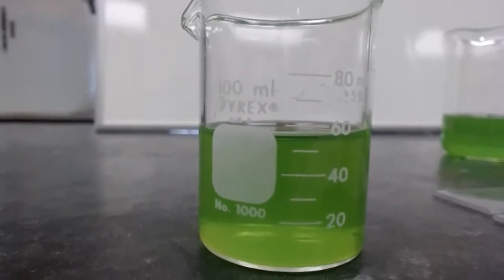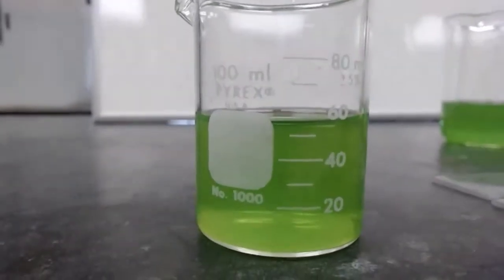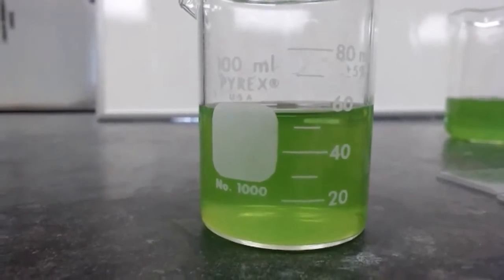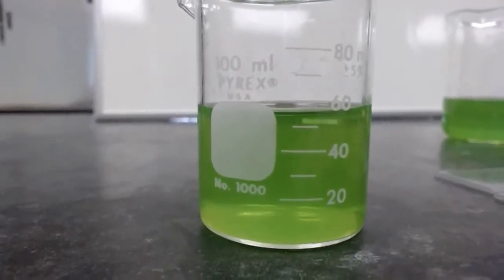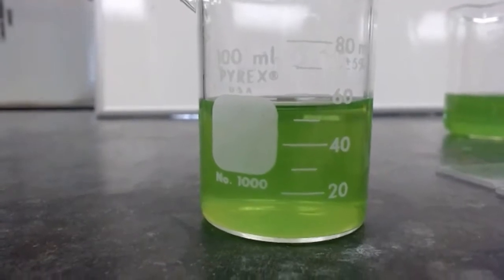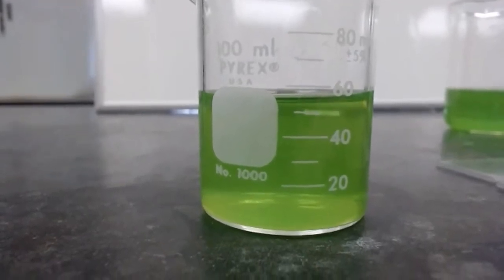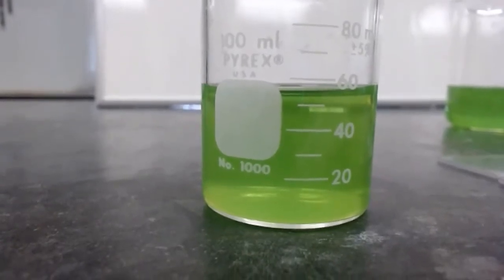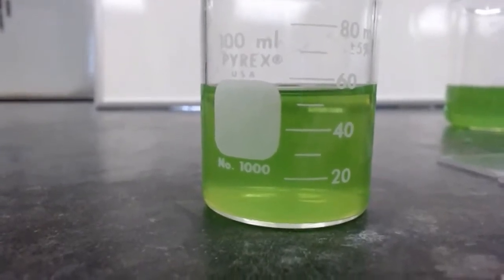All of those will be considered correct because you're estimating, you're doing your best guess based on what you see and what you know. And so what we know again is that it's between 50 and 60. And then we just have to estimate whether we think it's more than halfway, or less than halfway. So I'm going to record my volume.